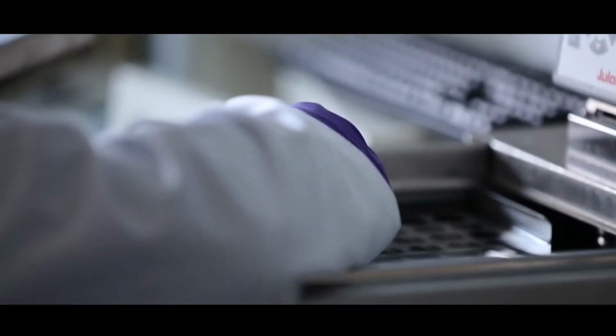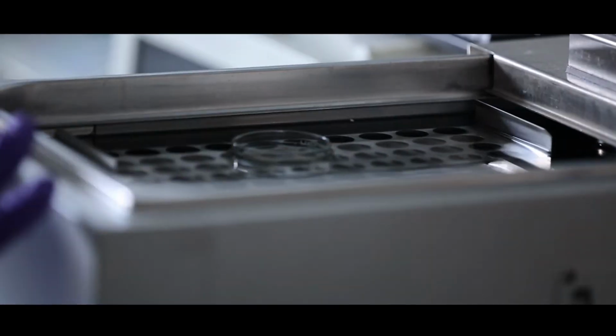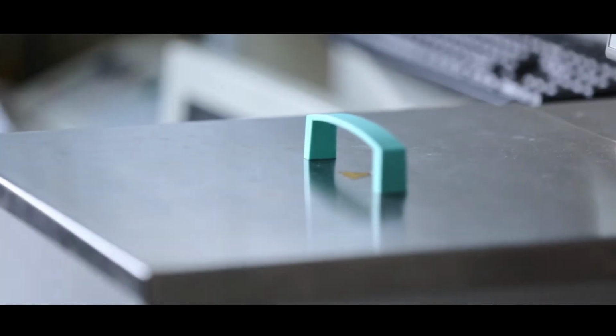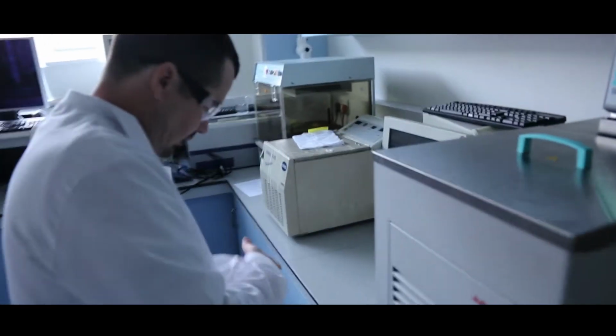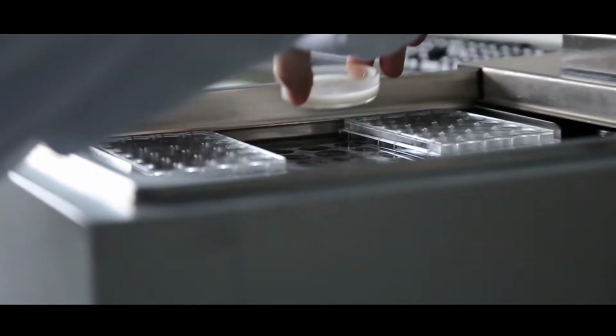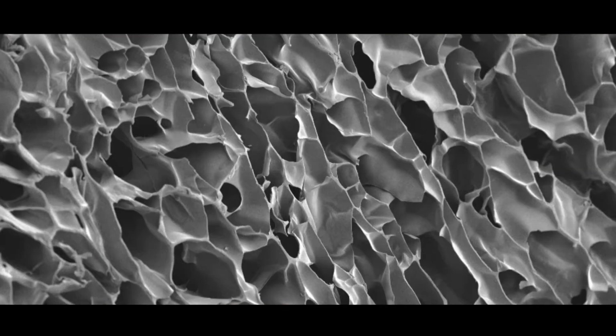Cryogel mixture is placed into a bath filled with ethanol, held at -20 degrees C. When hydrogel ingredients are frozen before they've had a chance to set, ice crystals form within the mixture, while the other components remain unfrozen and set like a conventional gel. When the material is brought up to room temperature, the ice crystals melt, releasing the water. This leaves a highly porous sponge-like material, the pores being a remnant of the presence of the ice crystals.